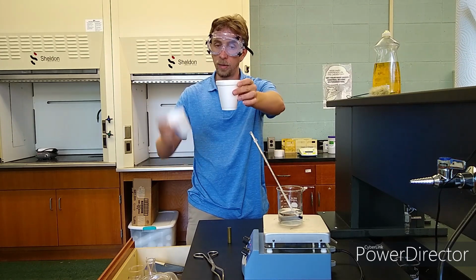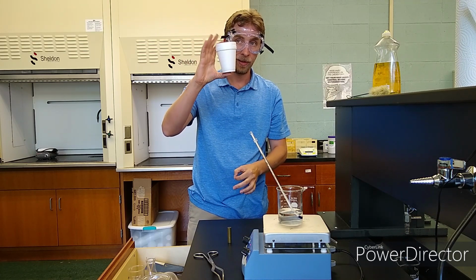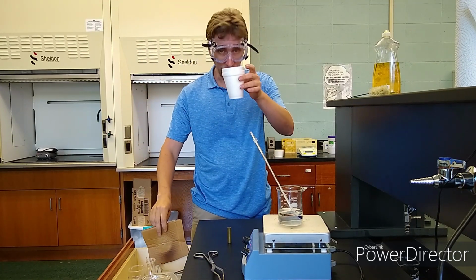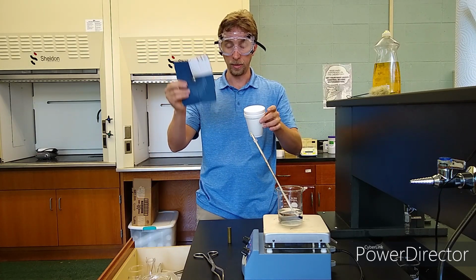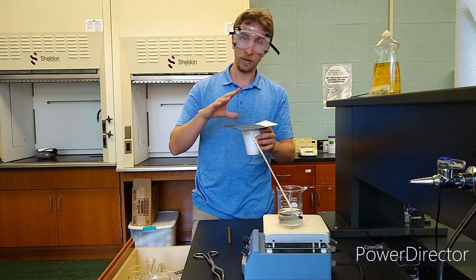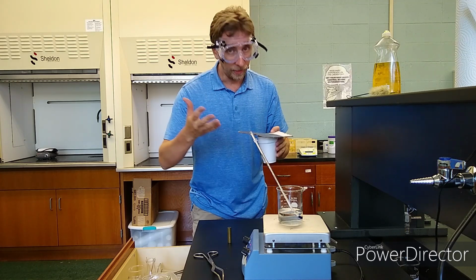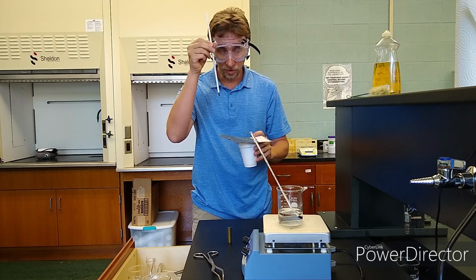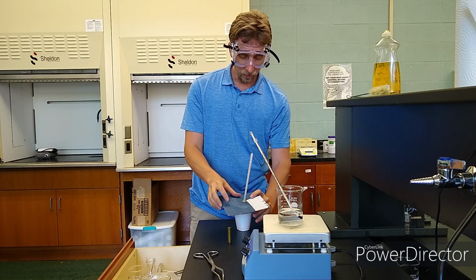There's one coffee cup, two coffee cups, double stacked. That is super insulated. This is the basis for our calorimeter. But not only do we have two coffee cups double stacked for extra insulation, we have a cardboard lid with a hole in it. That is pretty sophisticated right there. I know, try not to be too amazed. Now, in case that's not good enough for you, the final level of advanced technology is the thermometer. Put it in the hole. And that right there is our calorimeter.